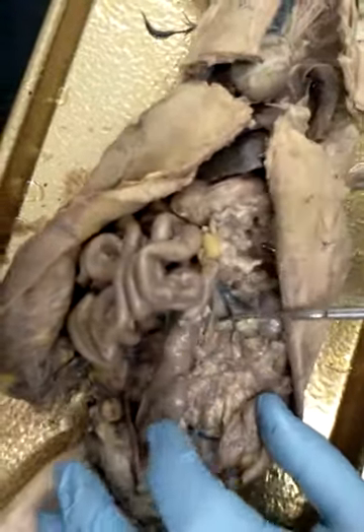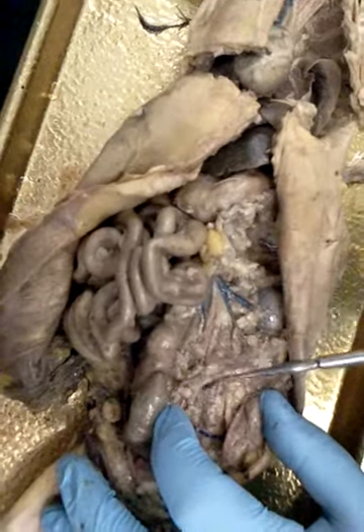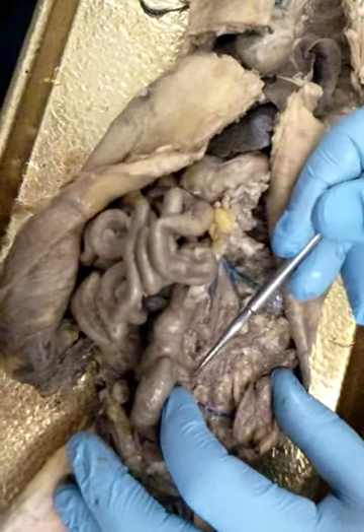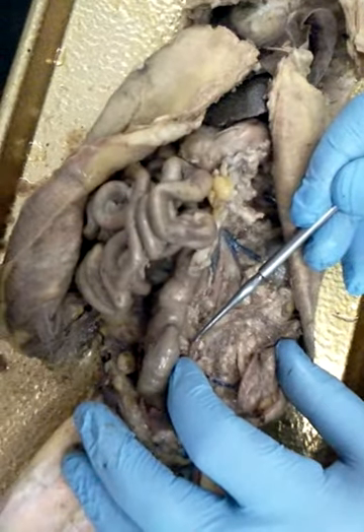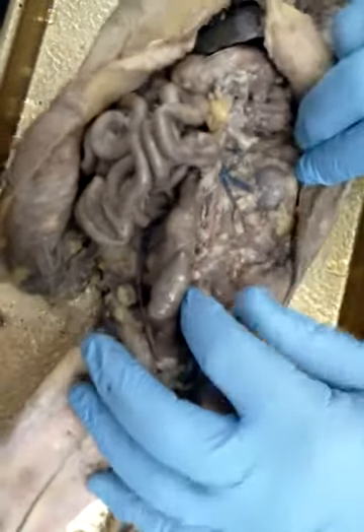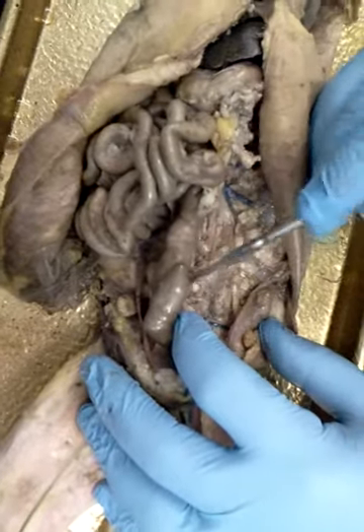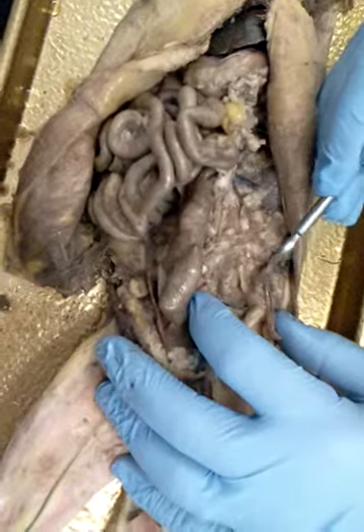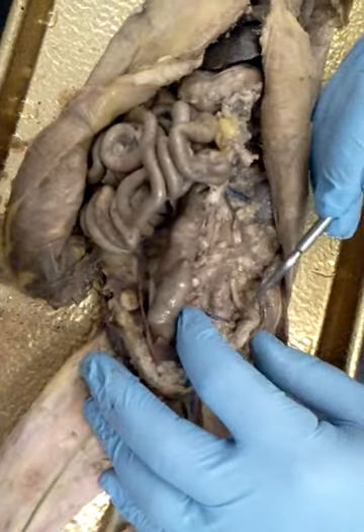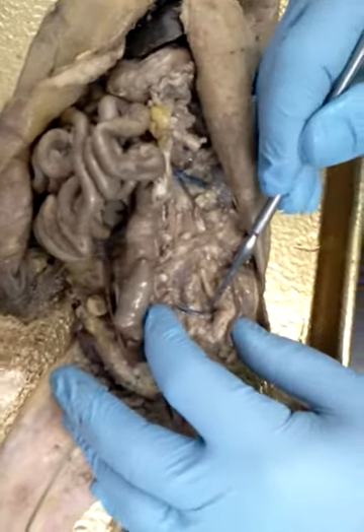Now we come further down the abdominal aorta. Here's the inferior mesenteric, which feeds the large intestine. Inferior mesenteric. As we still go further down, we come to the iliolumbar artery and the iliolumbar vein. Okay?